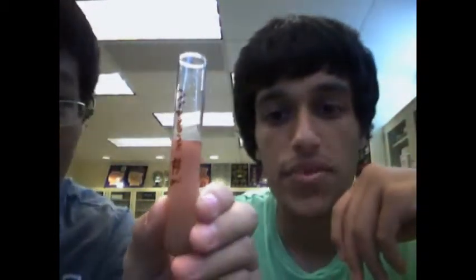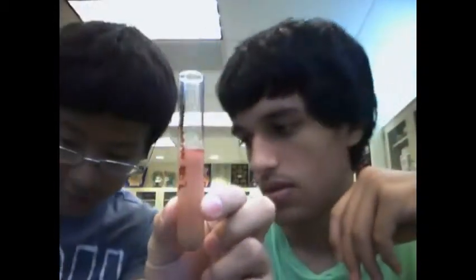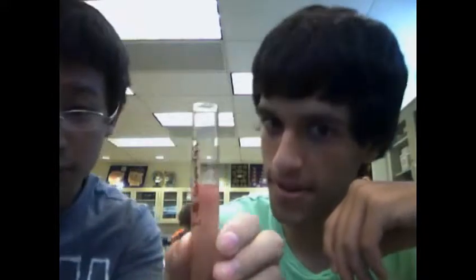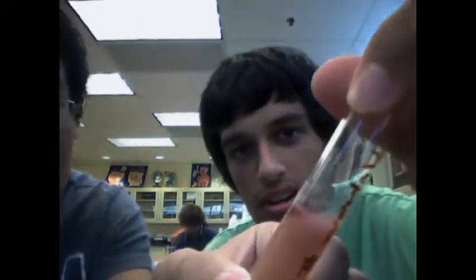Unknown substance number 3. At first sight, you might say it's negative because there's no separation. No separation. Well, take a look at this. Maybe hard to see. Oh, you can see it. Right there. Do you see the red?